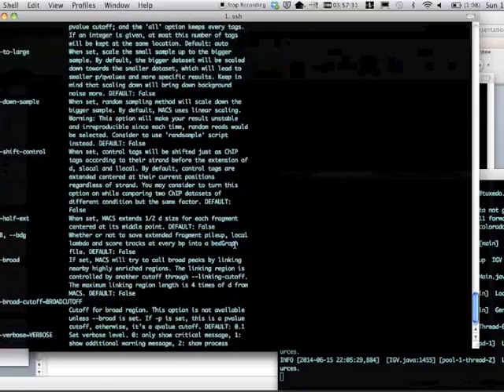And you can note that, like we mentioned earlier, we also have modules in the cluster that we can use to load, to make these tools available. In this case, we're using MACS2 2.1.1, and using the callpeak argument, we are just passing this set of instructions, this set of arguments to MACS.